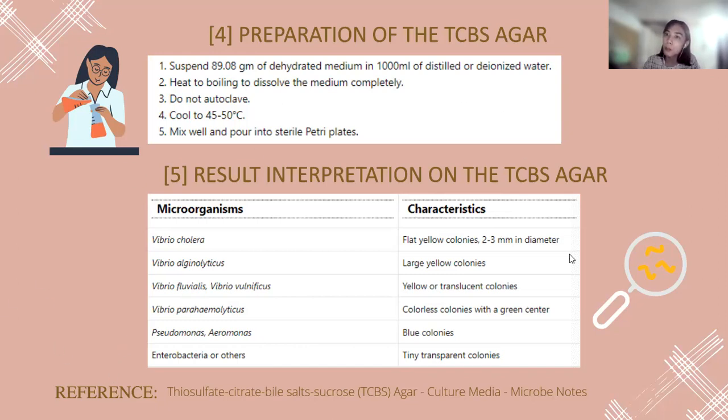So this overall presentation is based on this page, the Microbe Notes. Specifically, we refer to the Thiosulfate Citrate Bile Salts Sucrose, TCBS Agar, culture media, Microbe Notes.